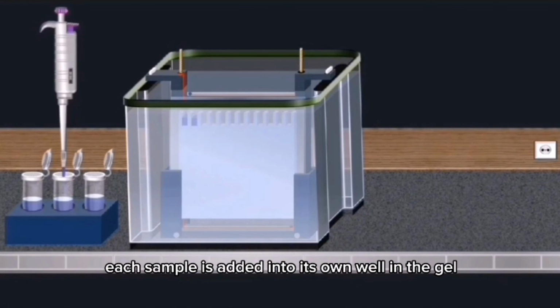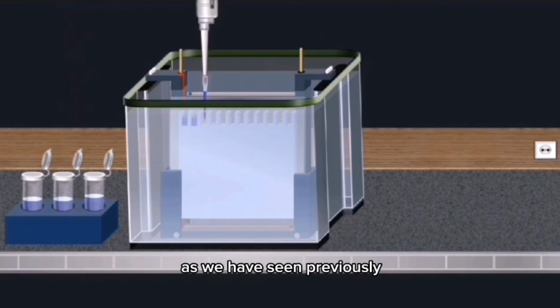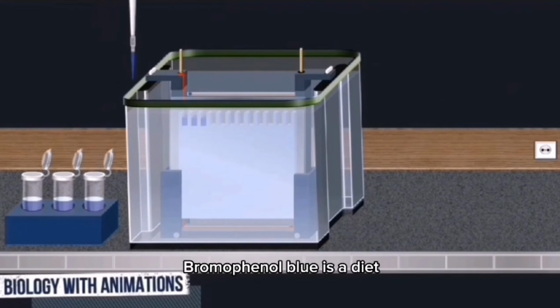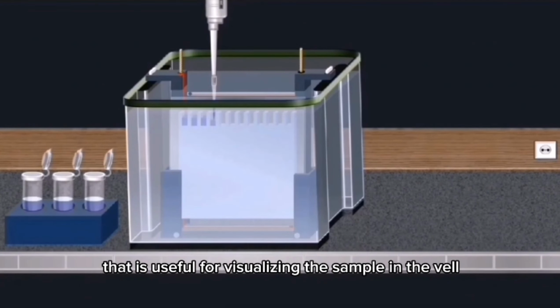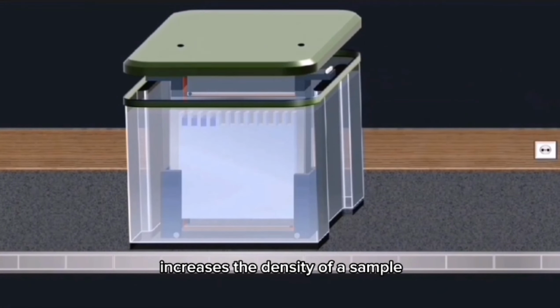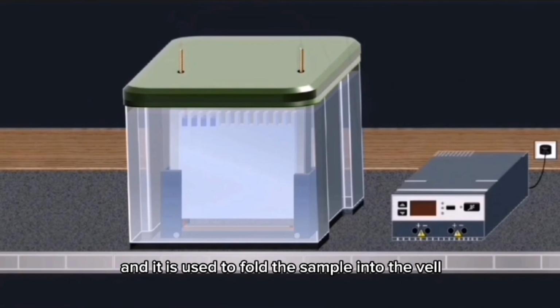Each sample is added into its own well in the gel. As we have seen previously, bromophenol blue and glycerol are present in the samples. Bromophenol blue is a dye that is useful for visualizing the sample in the well, while glycerol increases the density of a sample and is used to hold the sample in the well.